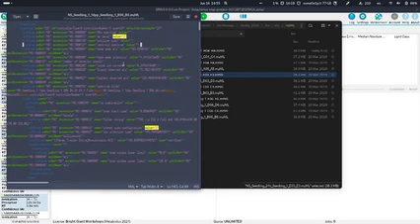Just one thing which I forgot. With the new SIRIUS, we now also import MS1 data. That's very different from before, because in SIRIUS 5, if you drag and drop an LCMS run, you only get compounds which have MSMS.